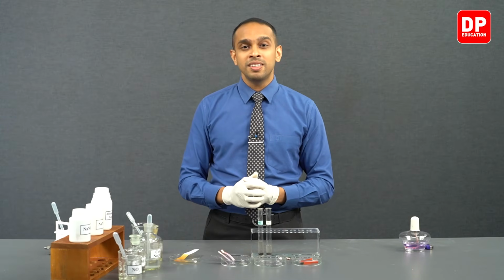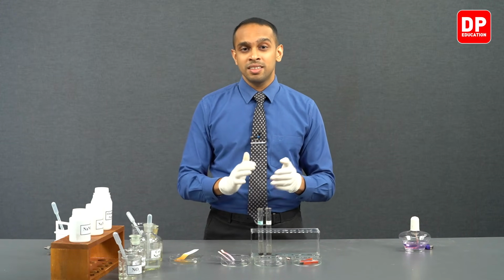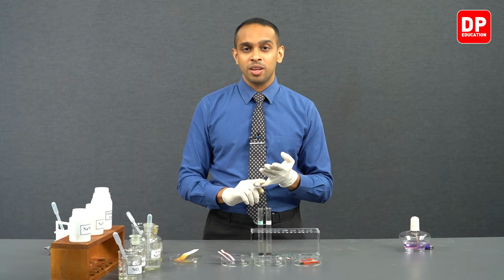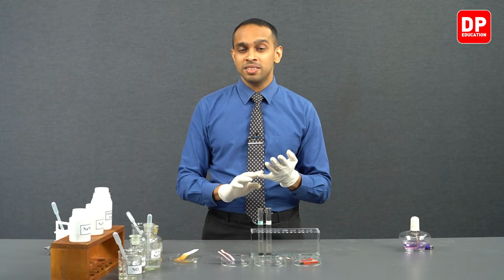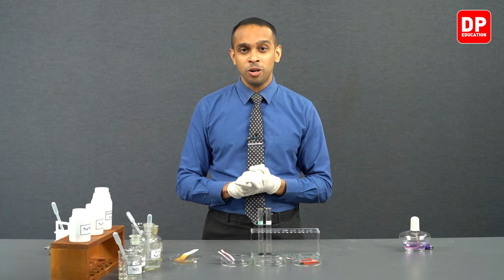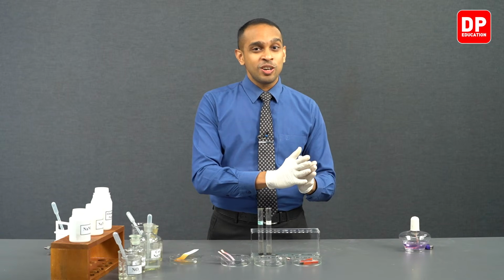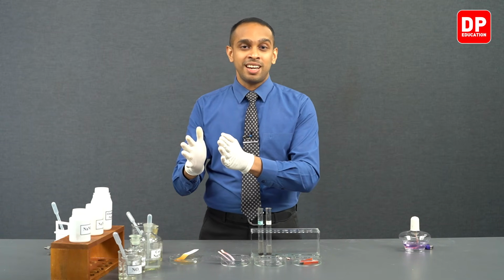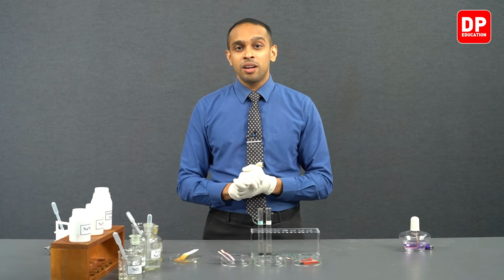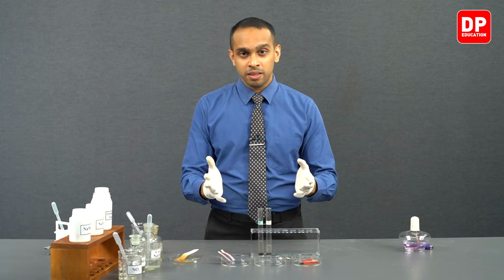Afterwards, we conducted the experiment with aluminium powder and nitrate ions, and then we conducted the experiment with aluminium powder and nitrite ions reacted with sodium hydroxide. And we saw as sodium hydroxide is added, aluminium got oxidized to aluminate anion, and nitrate or nitrite ions get reduced to form ammonia. And we can test for the released ammonia with the use of a filter paper soaked in Nessler's reagent.